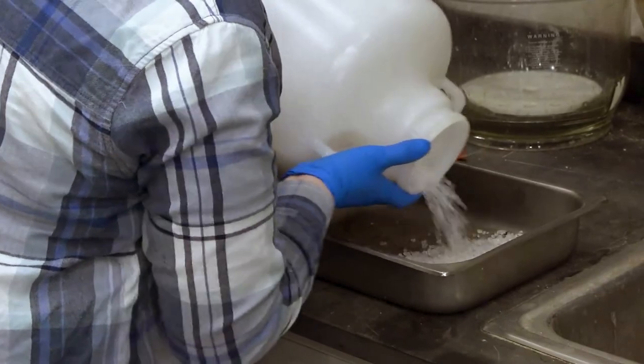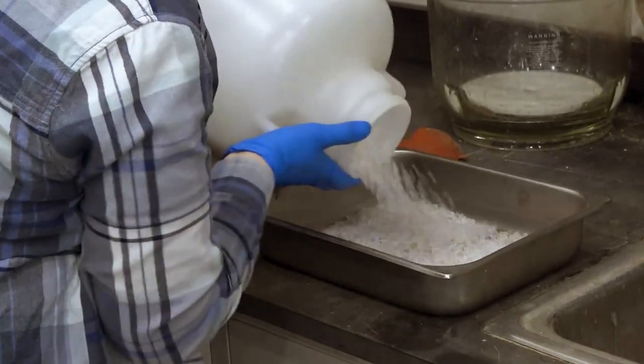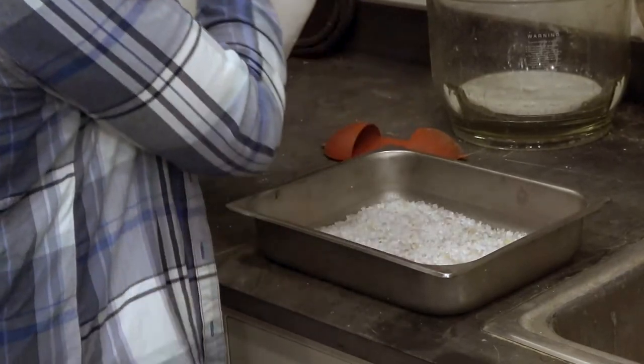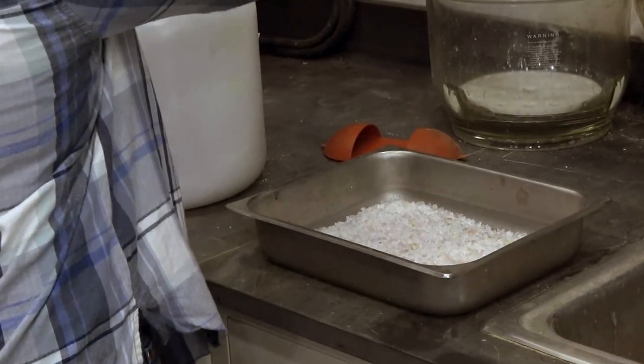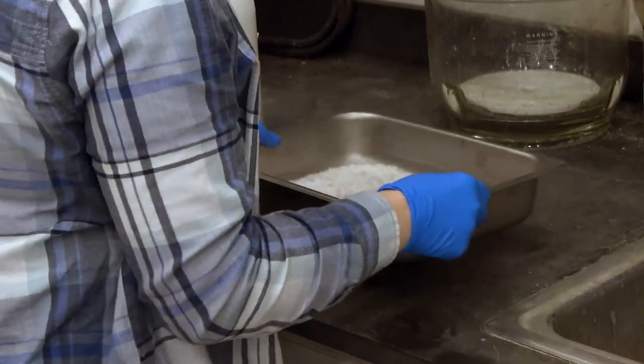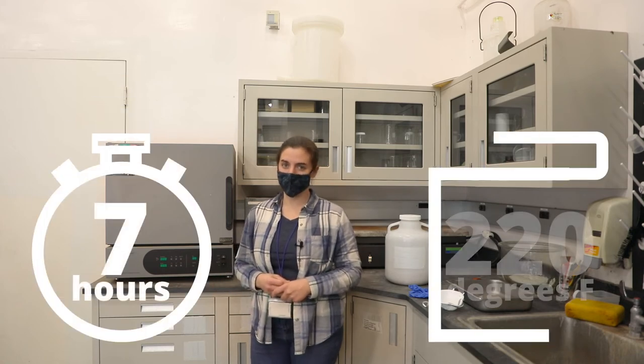You want to lay the silica flat in the tray that you're using. Here at the MAC Lab we have different kinds of silica gel from multiple suppliers, so we have some bead and some granular forms. You want to mix those in with each other so that they cook evenly. If you're not sure how long you should be cooking your silica gel for, a safe estimate is seven hours at 220 degrees.